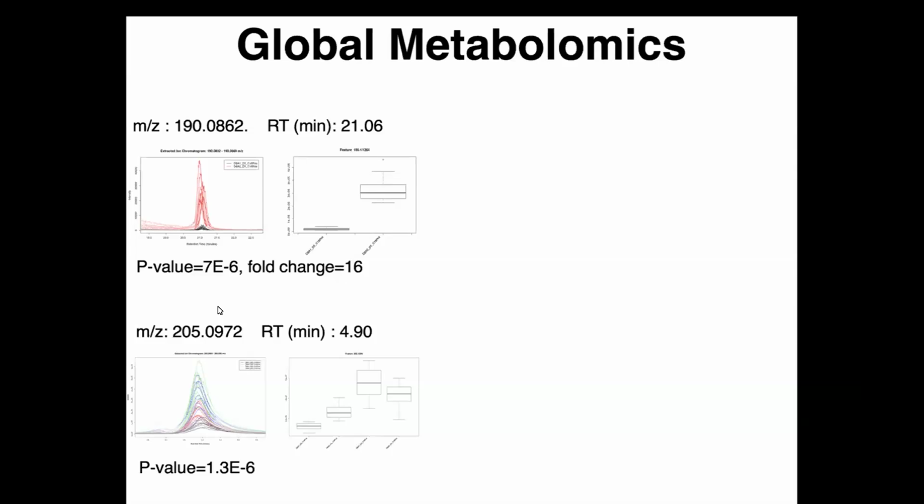To identify the significant dysregulated features, MS2 data were collected from the pool sample and searched against the METLIN database.